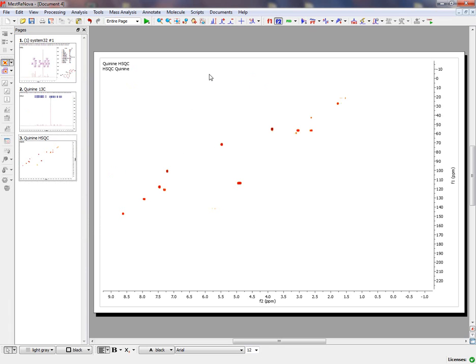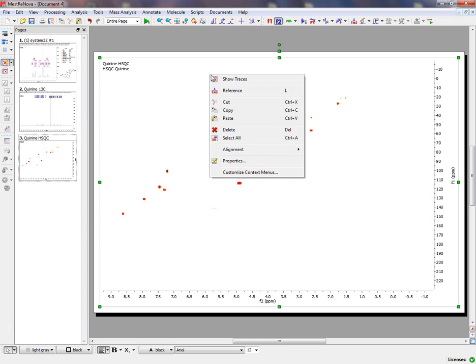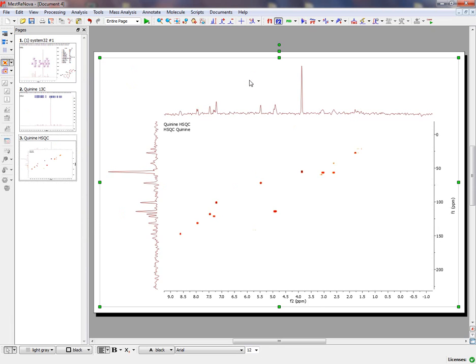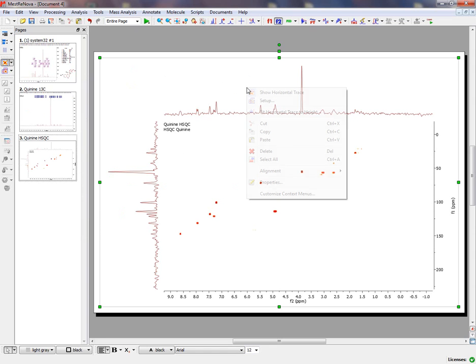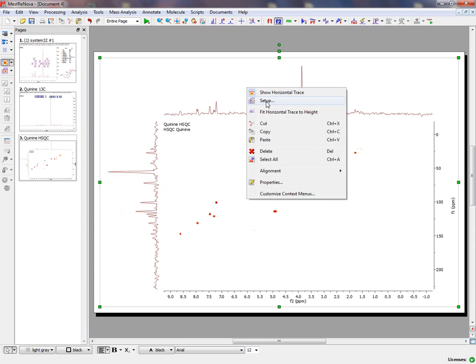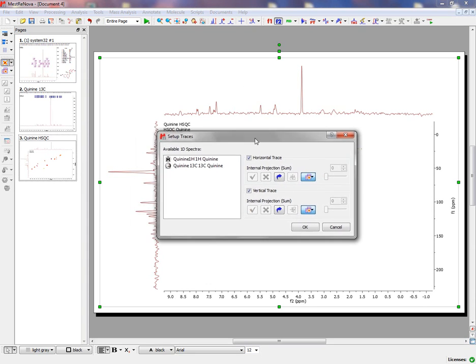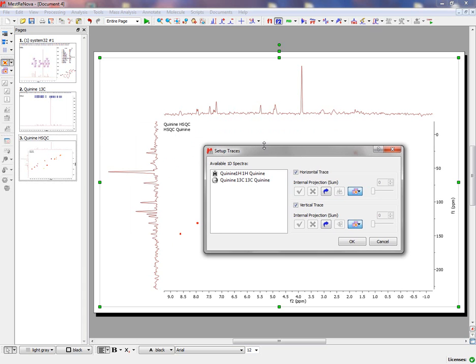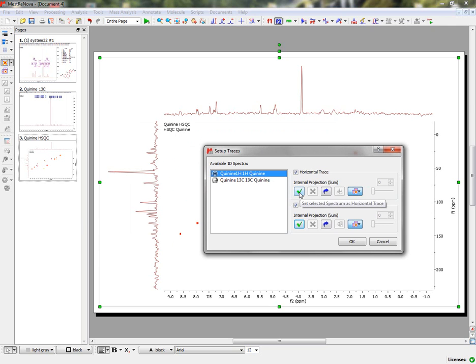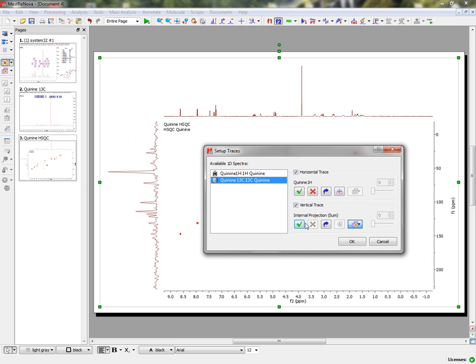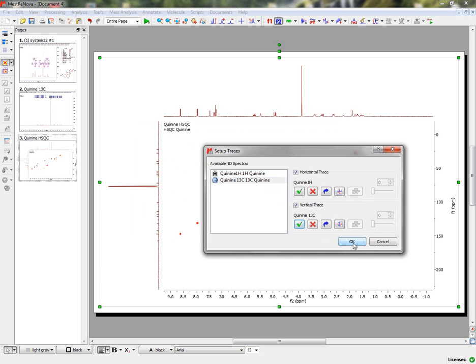Right-clicking on the Spectral window and selecting Show Traces will show the Vertical and Horizontal Traces. Right-clicking again on one of the Traces and clicking on Setup will open the Setup Traces dialog. From here you can import the Proton Spectrum as the Horizontal Trace and the Carbon as the Vertical one.